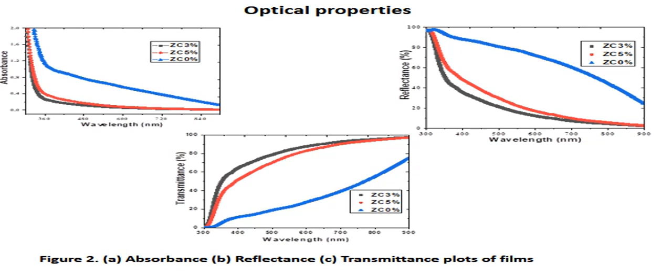The three follow the same pattern, just that the undoped sample has a higher absorbance compared to the doped sample. And even for the doped sample, the red line represents the 5% cerium, while the black line is for the 3% cerium. The 5% has a higher absorbance compared to the 3%.